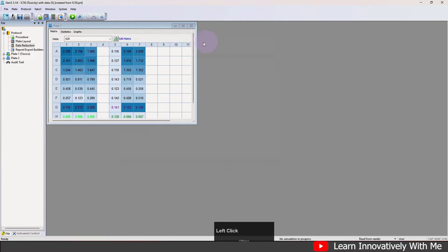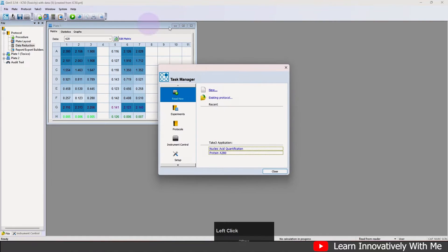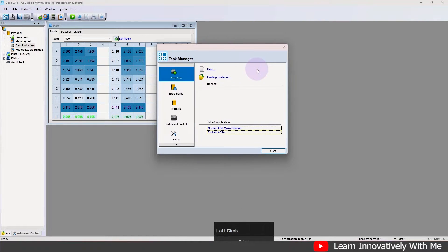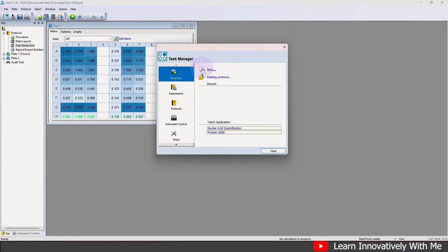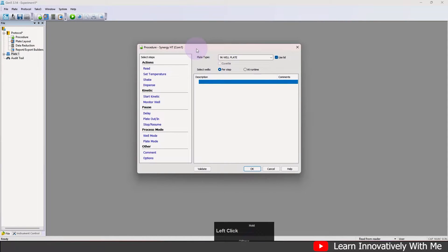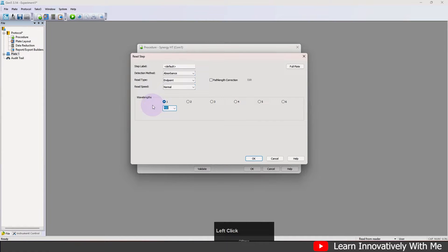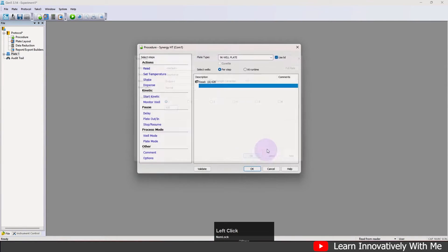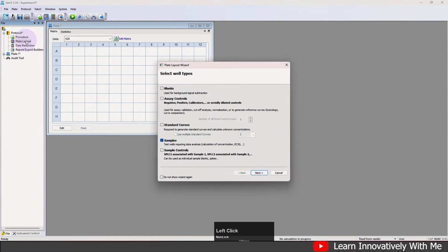I will show you how to prepare your protocol for your experiment. I'm going to open a new task to show you how to prepare your protocol and acquire your data from your plate. Click here on 'New' so the new protocol opens. Click here on 'Read' and I'm going to put the same value of 620 nanometers, but you can add a reference wavelength. Click OK.